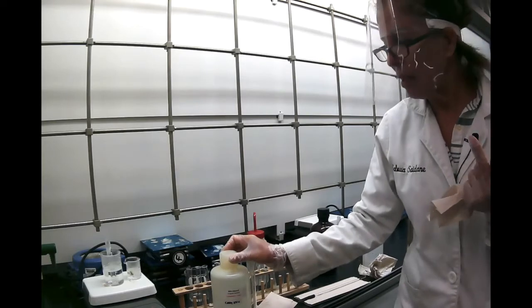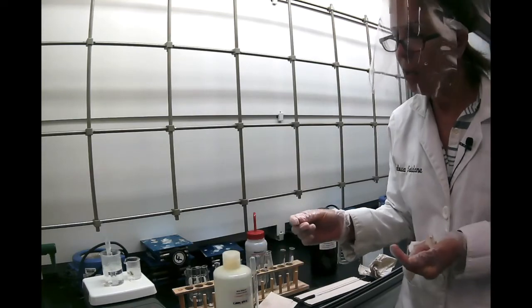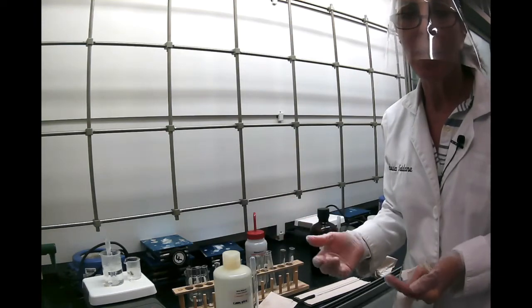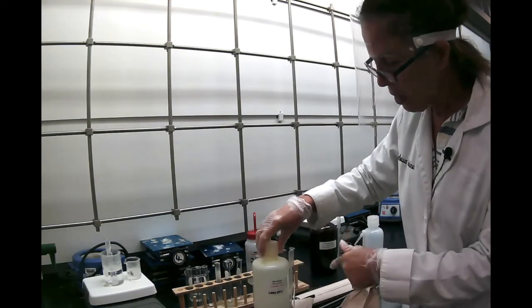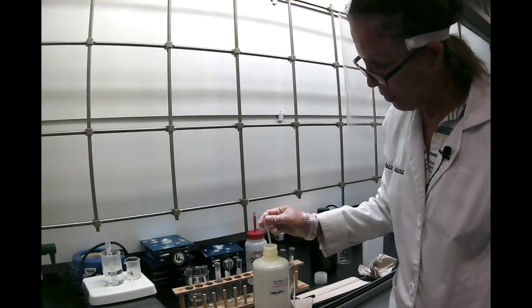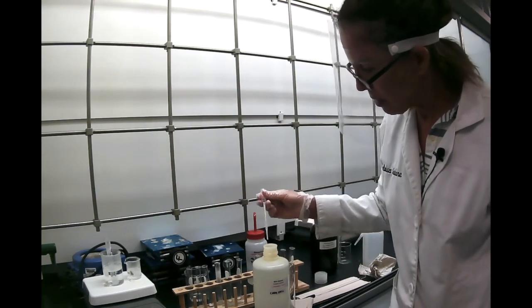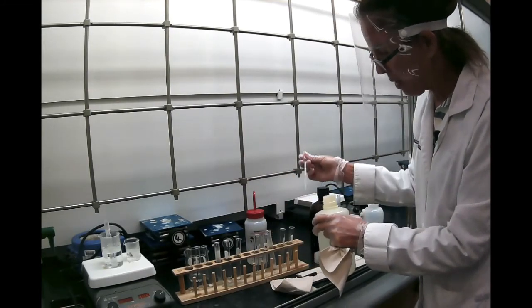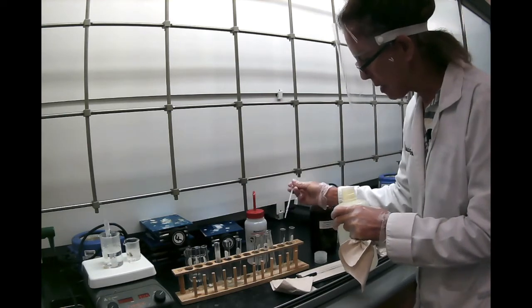Now, I want you to think about this. What is the difference between a water molecule and ethanol? Solubility has to do with the rule like dissolves like, meaning polar dissolves polar, nonpolar dissolves nonpolar. Alcohol and water are very compatible, so maybe we should expect similar results. So here we go. I'm going to put 1 milliliter of alcohol in my first substance, 1 milliliter in the second, 1 milliliter in the third, and 1 milliliter in the last.